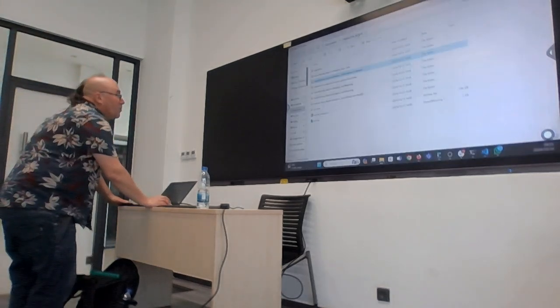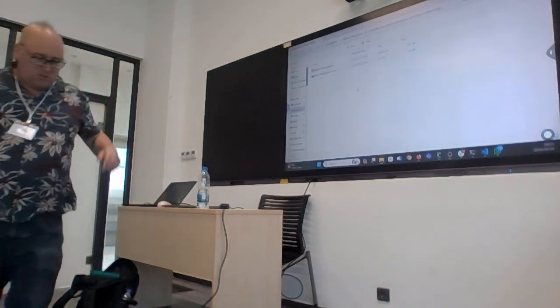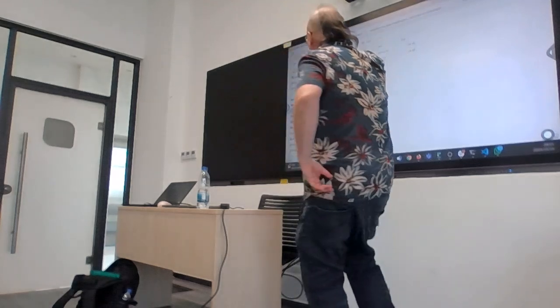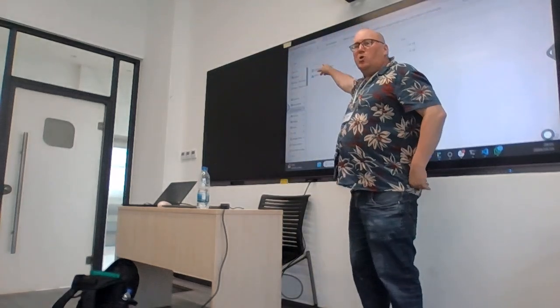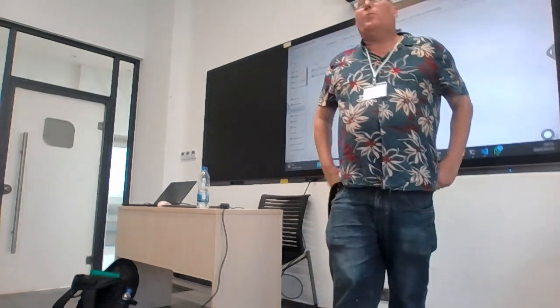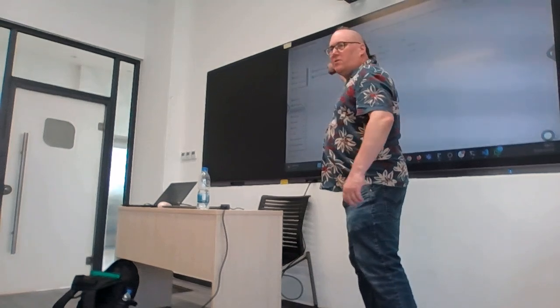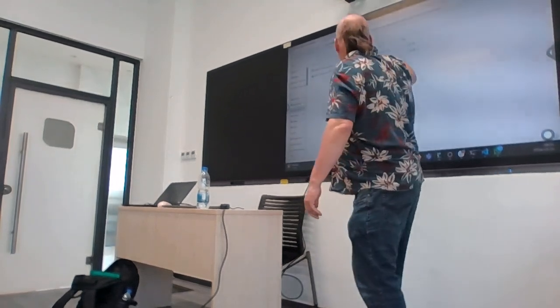And if I look in this folder, then this is actually the same consensus file. If you had multiple samples, you'd have multiple files here, right? But I only had one sample, okay? Here's your FASTA file, the consensus that we looked at just now. Here is a VCF file, variants, okay?